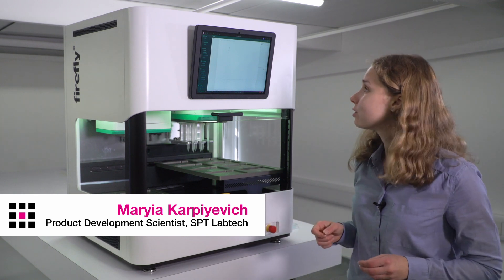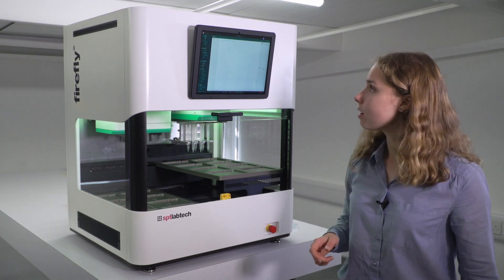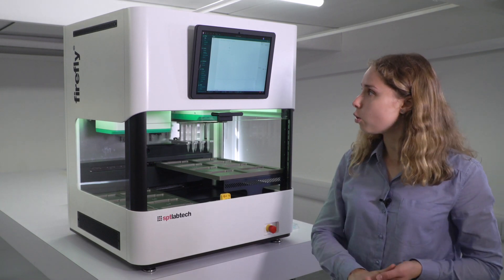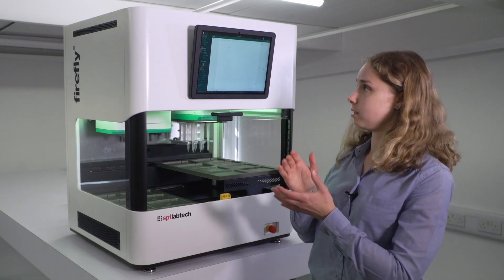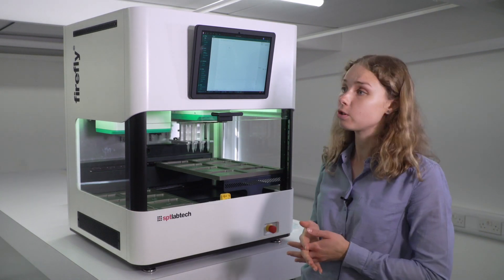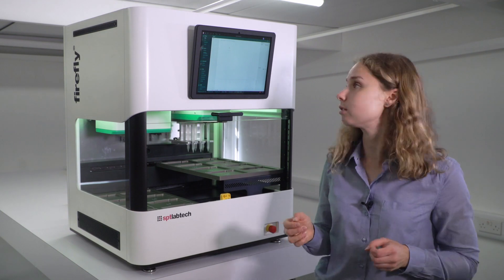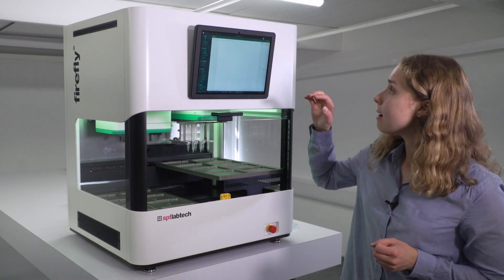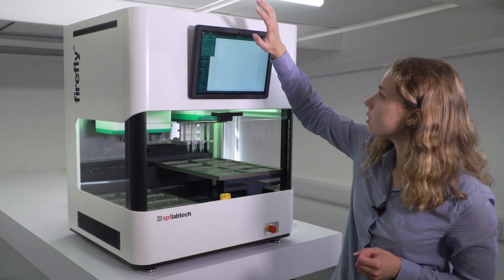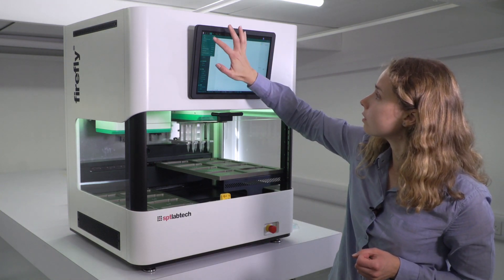I'm here with Firefly getting ready to set up a normalization protocol. At the moment, the software is open, but nothing is loaded. So I can just navigate to my protocol that I have created previously and get ready to set it up.